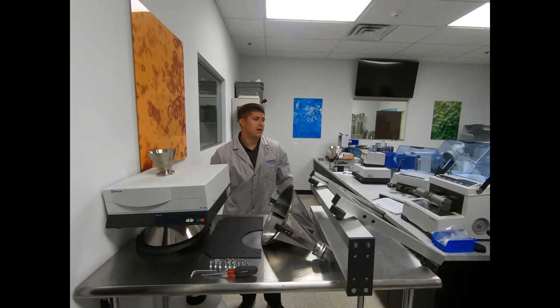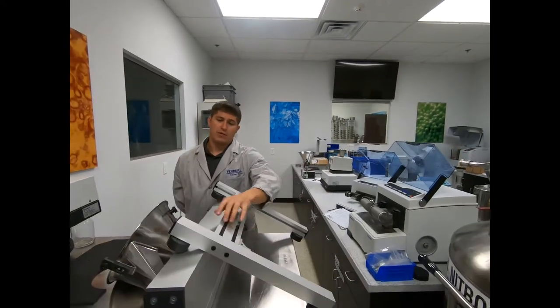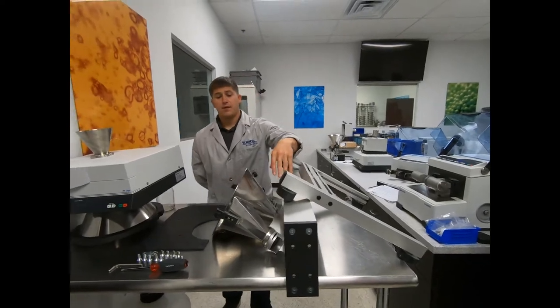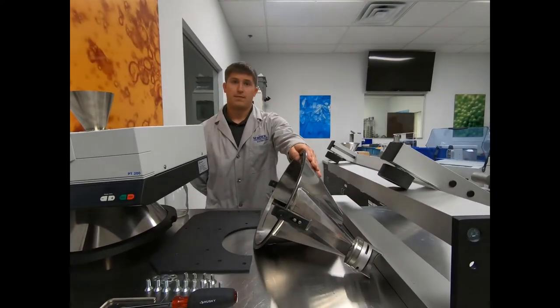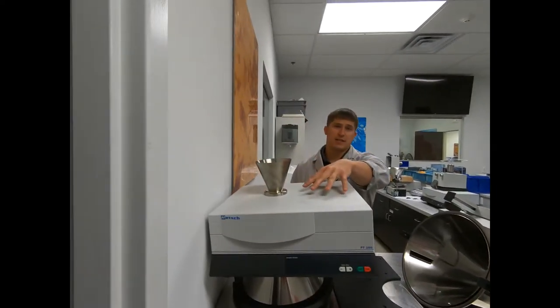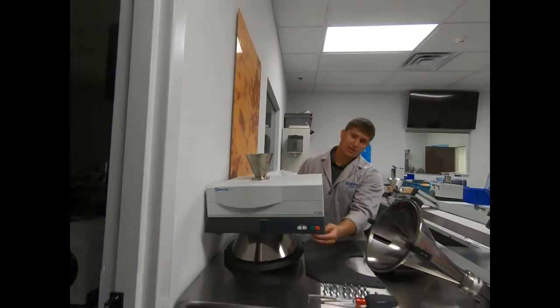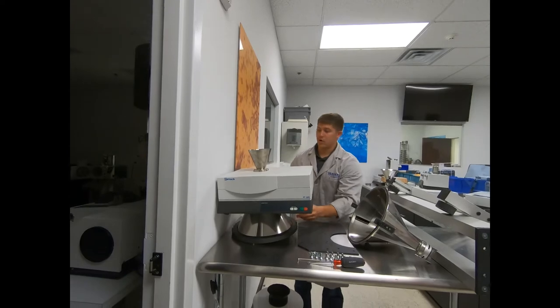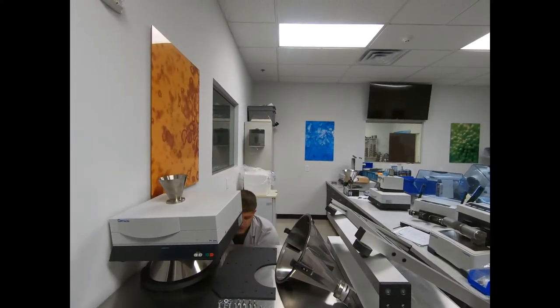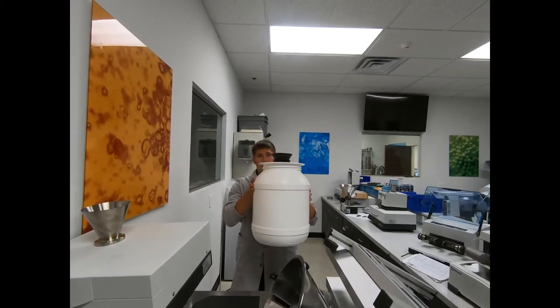To fully assemble the unit you're going to need your base frame with four rubber grommets, your stand, your bottom cone, your mounting bracket for the housing, the housing itself, as well as the top cone. You're also going to have two sample bottles, as well as your reject collector and lid.